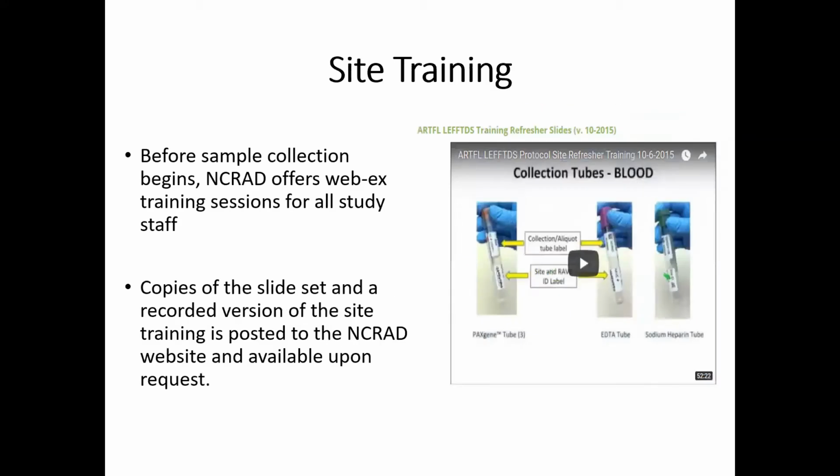We provide site training. Before sample collection begins, we provide a WebEx training for studies and their study staff. In some cases, if it's a very large study, we'll go to the startup meeting, and a copy of the slide set and a recorded version of the site training is posted on the NCRAD website and is available upon request.